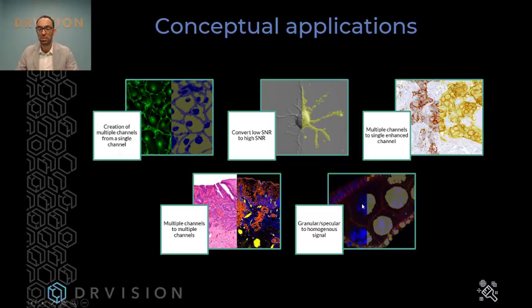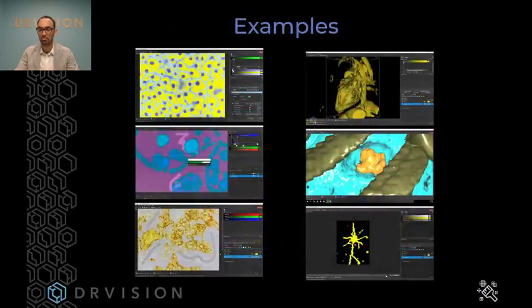And you may end up with dark areas within the nucleus. This can be a problem for segmentation because it will start to partition things in the wrong way. So with the pixel classifier, you can, let's say, homogenize that nucleus so that the whole nucleus is nice and even, and then you can much more easily segment the images using the regular algorithms.